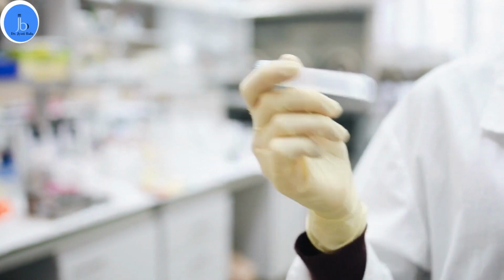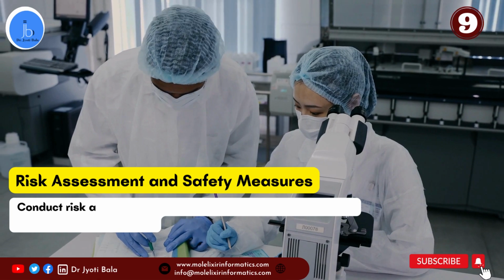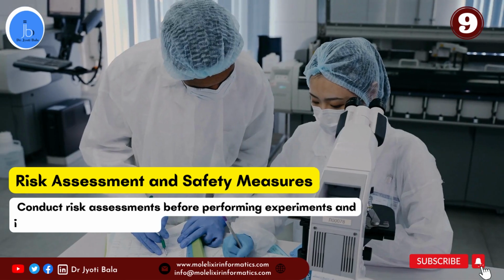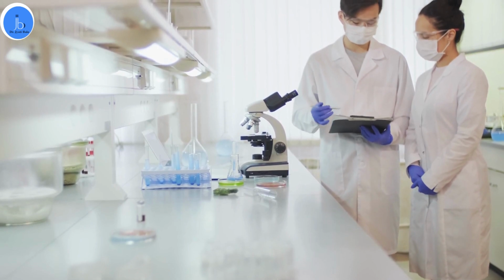The number 9 is risk assessment and safety measures. Before conducting any experiment, perform a thorough risk assessment. Identify the potential hazards and accordingly implement appropriate safety measures to mitigate the risk. Ensuring the safety of yourself and your colleagues is of utmost importance.